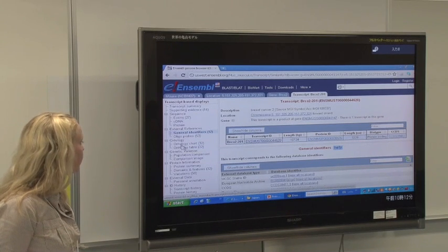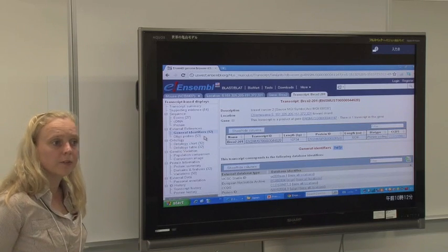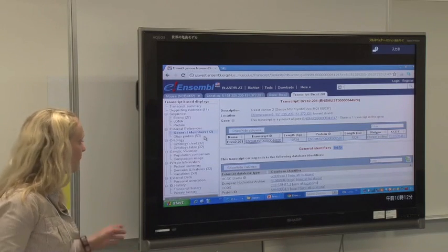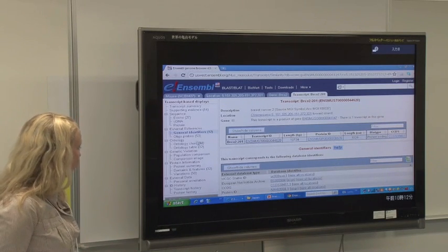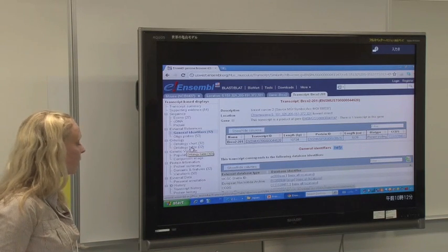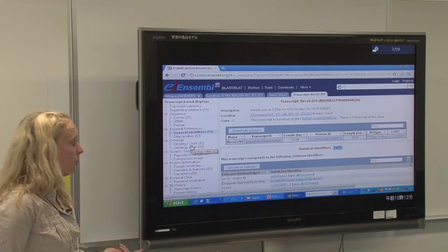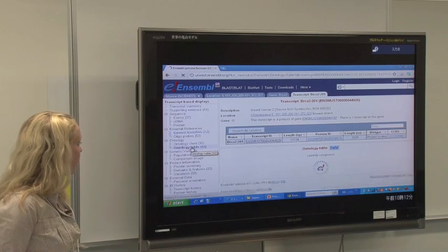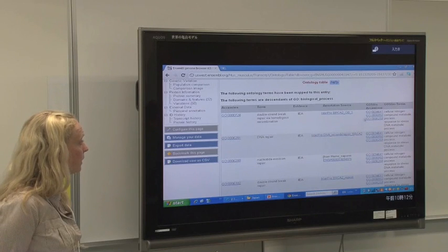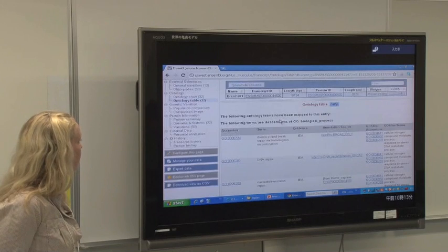We also try to bring data from the gene ontology database. Now, not everyone knows what gene ontology database is. So the links are here if you're interested in ontology tables, so they would cover the cell localization, biological function, and molecular function. So you can opt for a chart or again a simple to understand table with all the direct links to GO and GOSlim in this case.